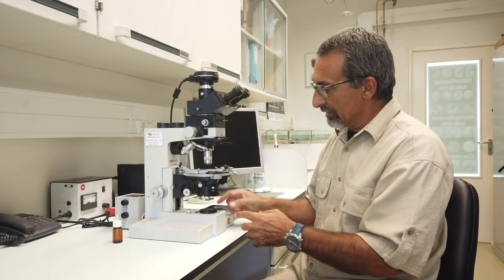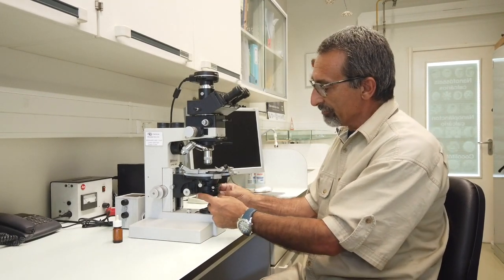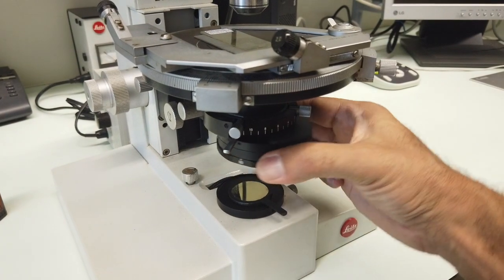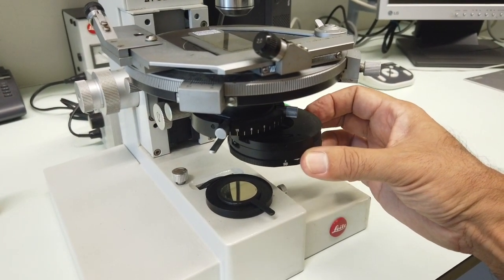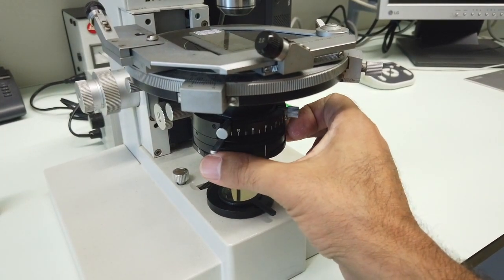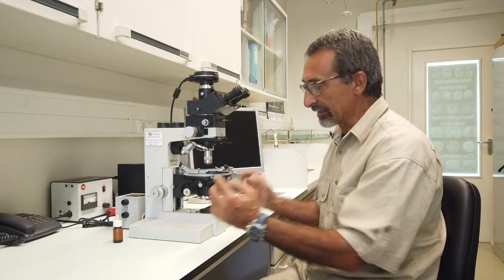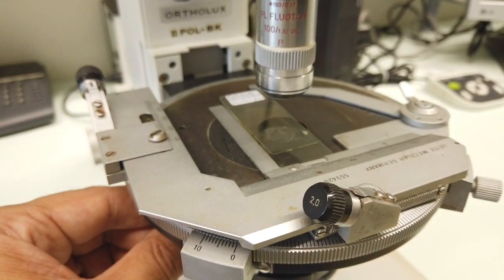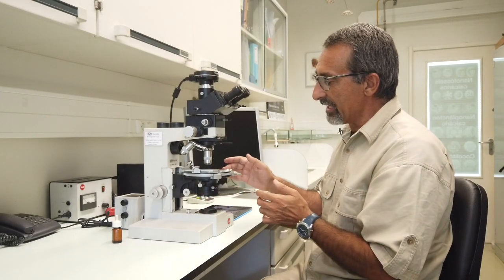In this case we have the light source that's coming in this way and then we have a polarizer here. We'll discuss this later on. We have here a polarizer, a linear polarizer, then we have here a condenser that focuses all the light in a very small beam, and then we have a rotary stage.